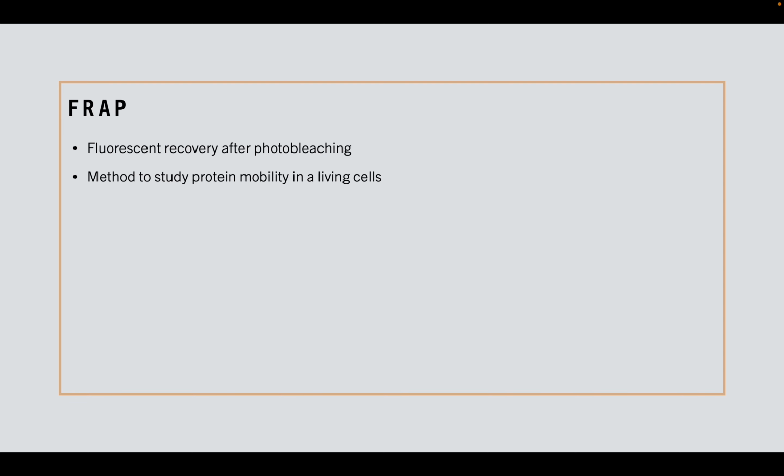But in the cytoplasm, the protein is already present, and I will not get a better idea of how much protein is moving, and whether the protein that I am seeing is already present, or is moving upon some stress condition. So what we can do is photobleach that area, and once we photobleach that area it will become black, and all the molecules that are present there will become distorted, or there will be no protein. And then I will leave the sample for some time, and then I will see if the protein is moving from the nucleus to the cytoplasm or not.